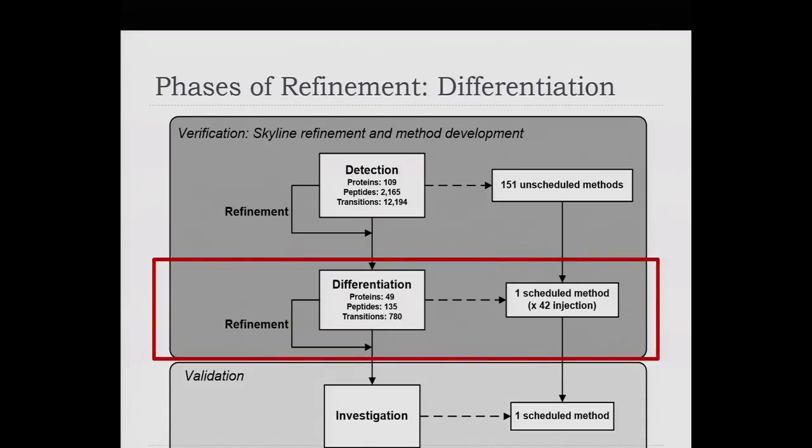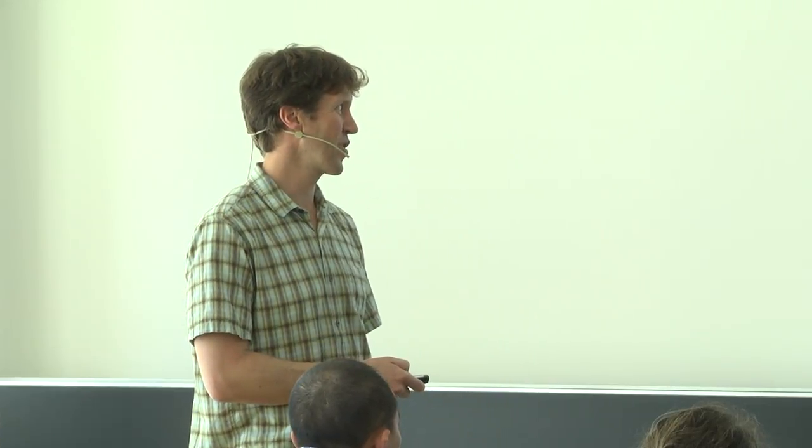So our idea was, well, we still didn't need to order synthetic labeled reference peptides to do accurate quantification until we had determined that not only could we detect these things, but that there was some probability of them being differentially abundant. So no point in ordering synthetic labeled reference peptides for peaks that weren't changing between our case and our control.